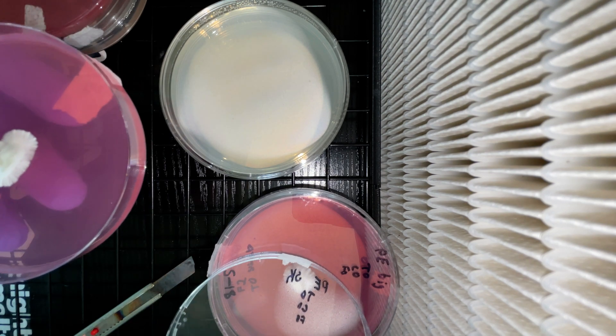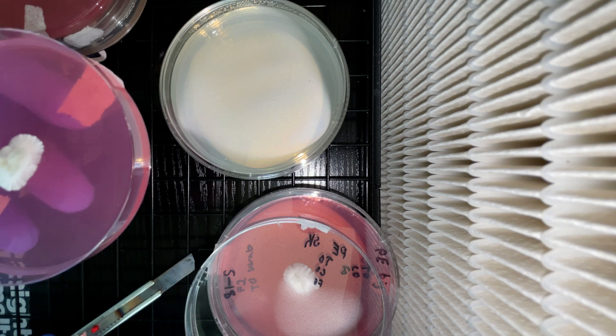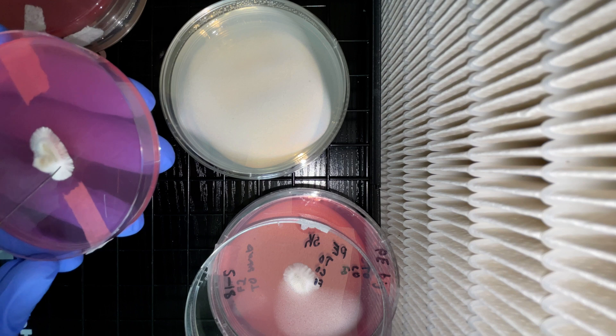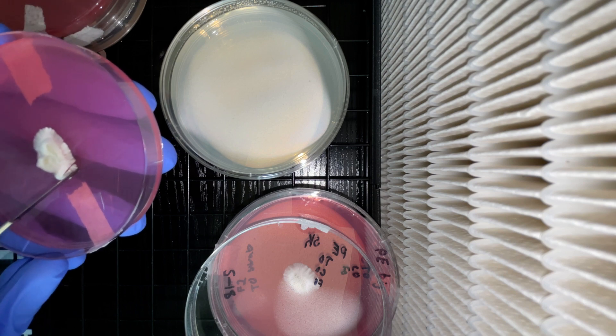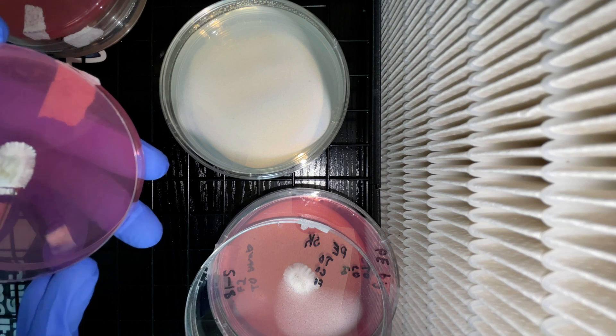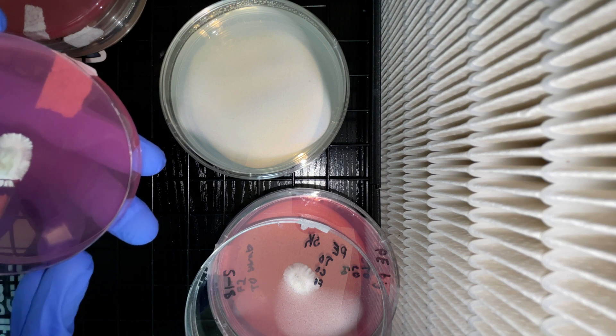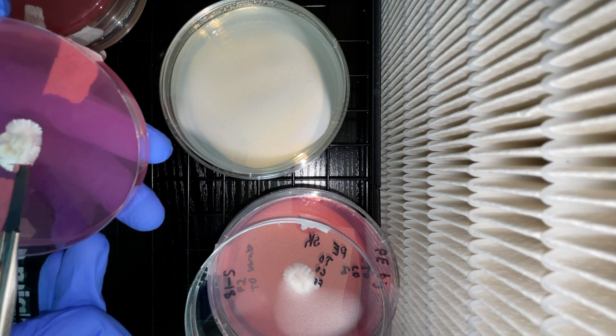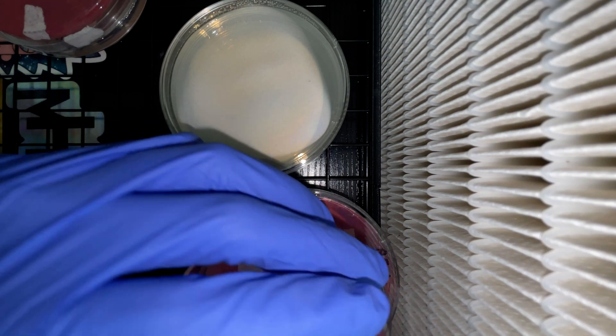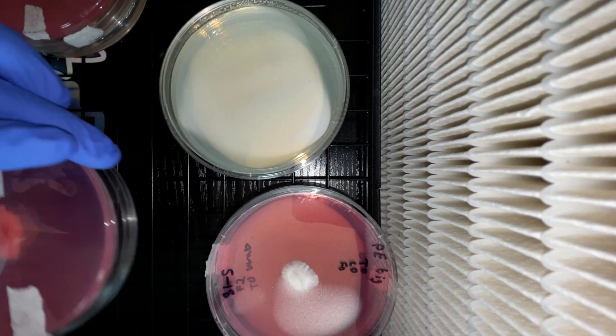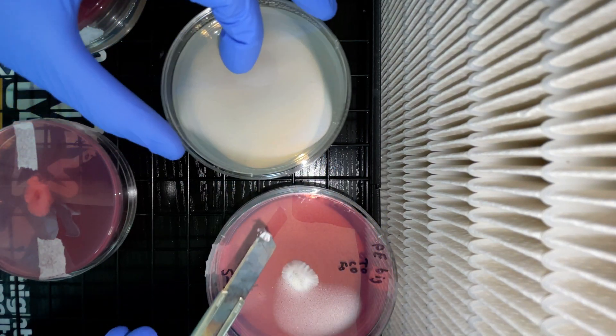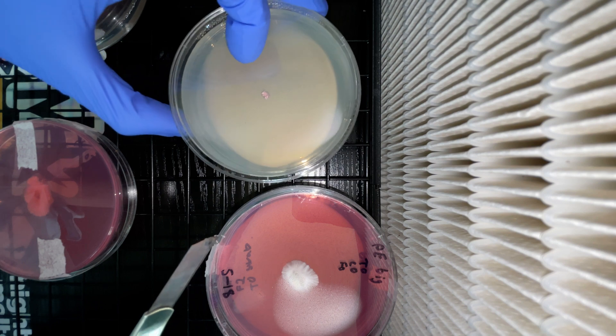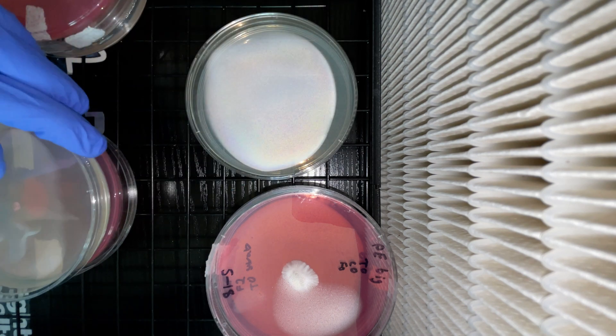As I've been recently injured, my money situation hasn't been the best. This caused me to fall behind in my agar work a lot. I had lots of transfers to do and was lagging behind. Now that I have this flow hood, I was able to pour a bunch of agar plates and slam out all the transfers I needed to do, which falls right in line with our grow along projects.